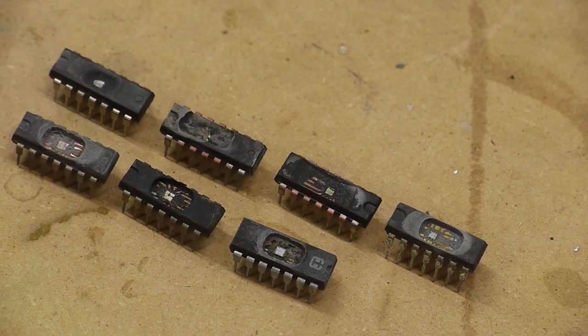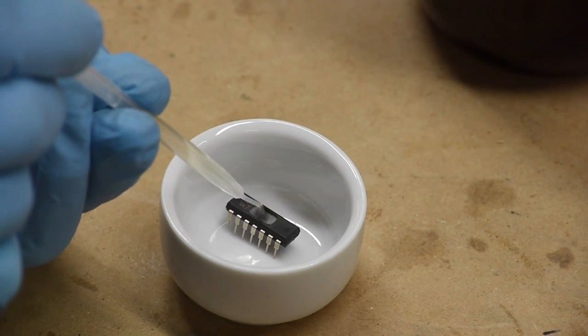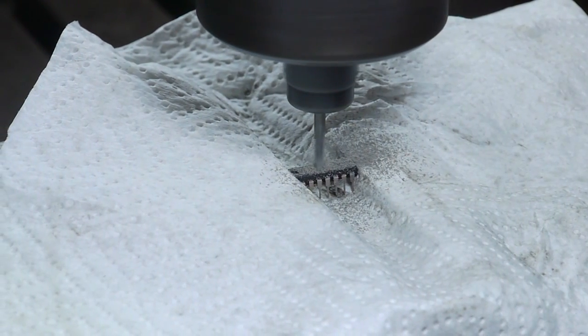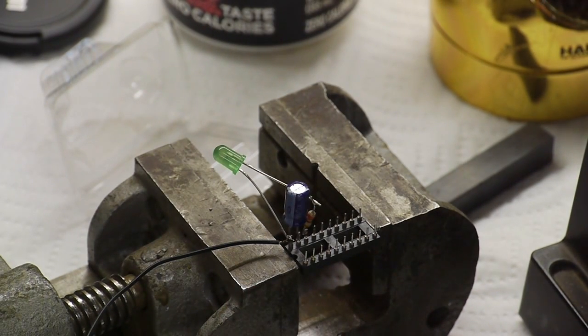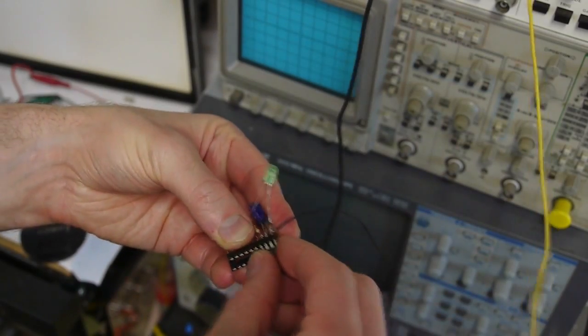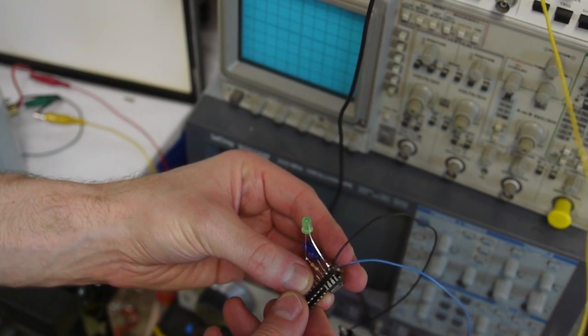So let me show you how I did this. I've been decapping chips for a little while now — I first did a video a couple months ago about it and I used fuming nitric acid to dissolve away the package after milling a little pocket in the top of the chip. For this experiment I wanted to use a circuit that was self-contained, so I went to the venerable 555 timer chip and decapped a few of the CMOS variants of the 555, then verified that they were still working.